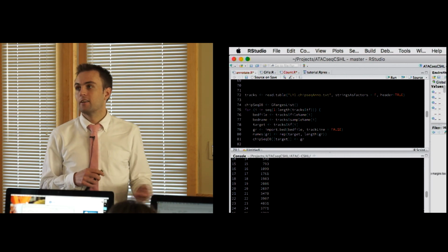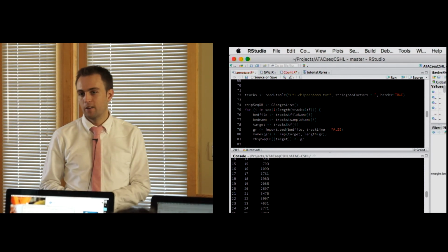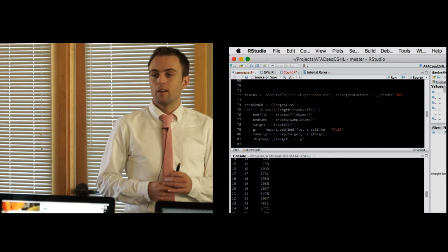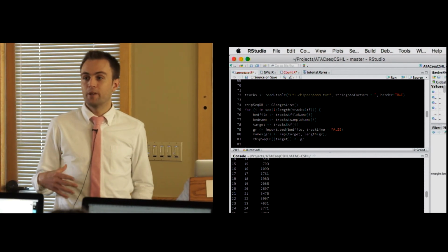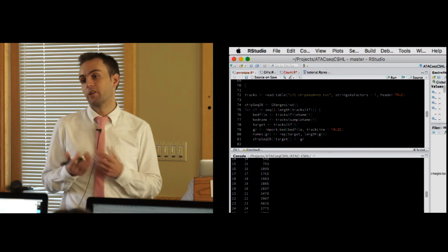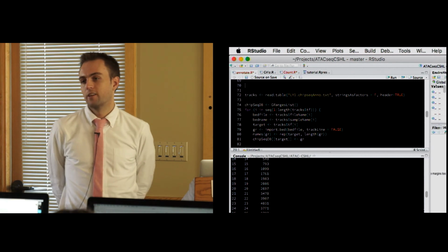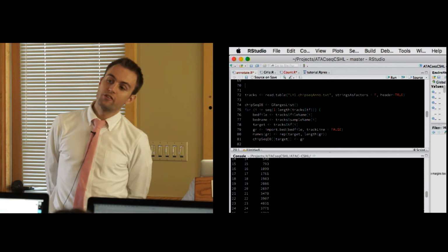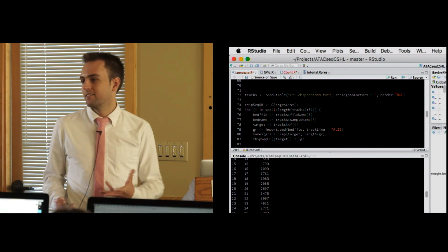One idea is that these are regions that are likely to be enhancers. That particular mark is like H3K27 acetylation, so it might be a pretty good readout of where there's regulatory events happening. If there's an area that's pretty likely to be an enhancer and also has open chromatin, that might be somewhere where we could do more specific motif analysis, for instance. What factors are there? How does that location change if we treat with an inhibitor, or between a related cell type?